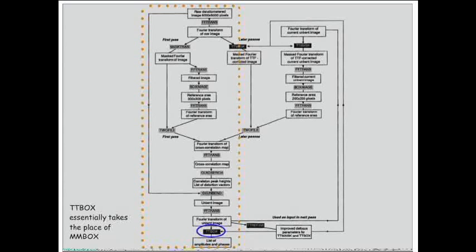In practice, because the unbending and the TTF correction are not independent, you need to do cycles of refinement. There are additional programs that allow you to do that. One of them is TT Refine, and basically that refines the defocus and tilt angles, and then you can use those refined values to give you better values for either TT-Box or for another program called TT Mask. TT Mask I'll come on to next.